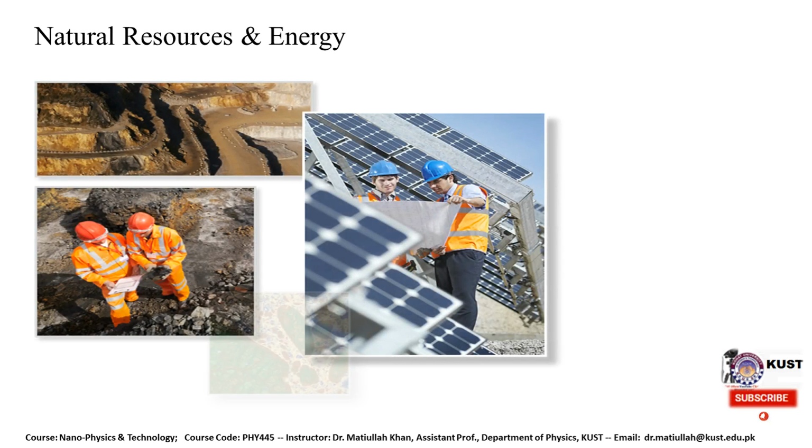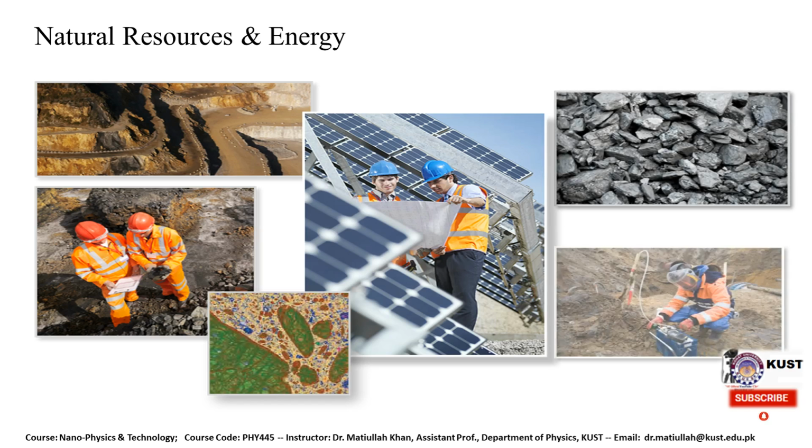If we look at natural resources and energy, electron microscopy is equally important in this field, because as we discussed, we are improving the properties of materials, and this improvement is only possible by making a relationship between structure and property. We normally know that by changing the structure of a material, the properties change. So investigating the structure from the top to the bottom approach is only possible with the help of microscopy and high resolution electron microscopy.